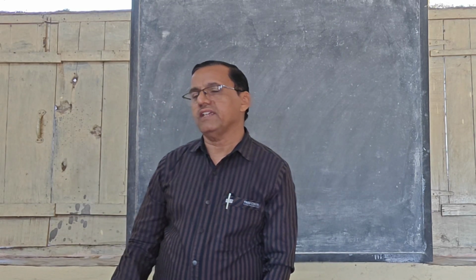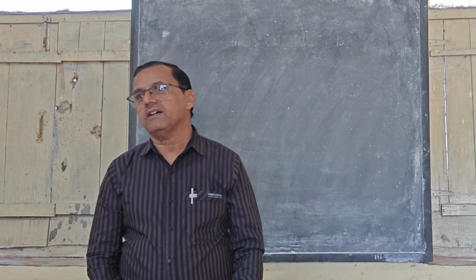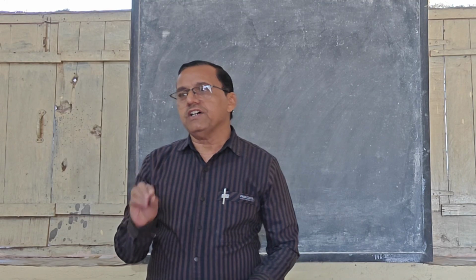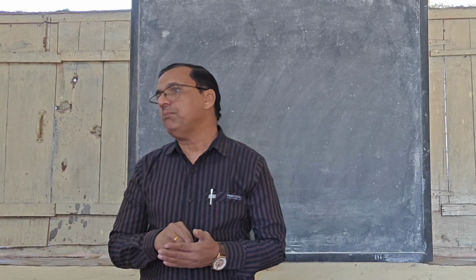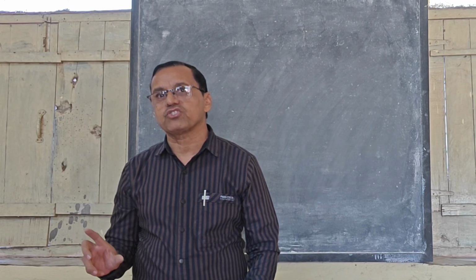Hello friends, good morning. In the previous lecture, we discussed microtechnique, which are the basic steps in microtechnique. So which are the steps? The first step is collection of material. After collection of material, the animal can be killed. Killing means sudden and permanent stoppage of life processes.